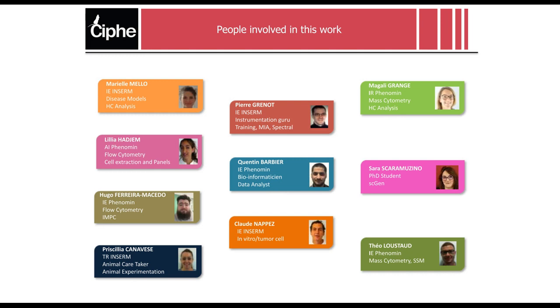What we have tested basically is that the solution is compliant with lots of different conventional flow cytometers. Each time, the FCS file format from one provider to another may be a bit different. So Cytobank solution is very reliable, and it's basically a sort of Swiss knife, so you can use it to look at whatever dataset generated on this instrument.